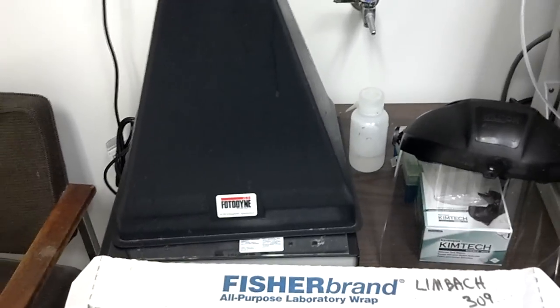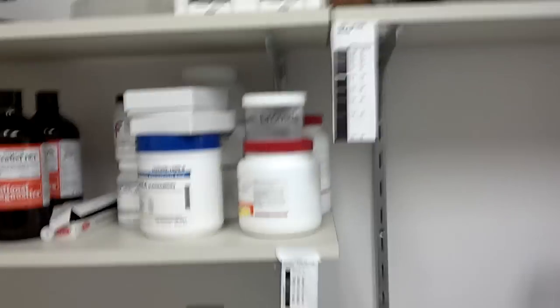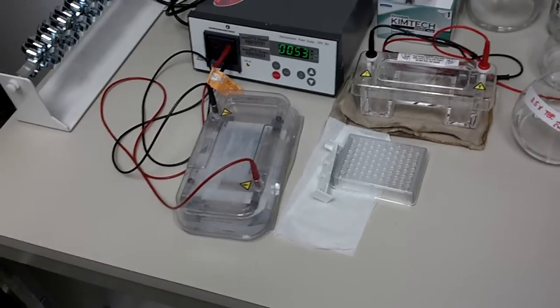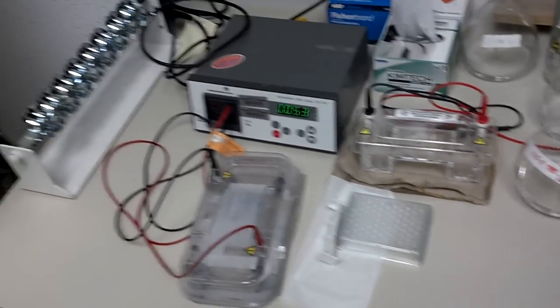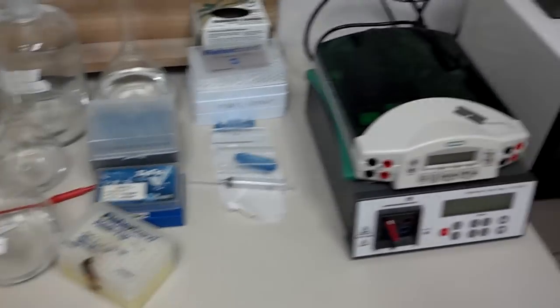This is our gel room, gel electrophoresis. This is our dark light. Once we get our gels and run, we put them on here to see where exactly our proteins are at. It's reagents. This is the gel electrophoresis. This one we commonly use to determine if our proteins are clean or if our oligonucleotides are separated.